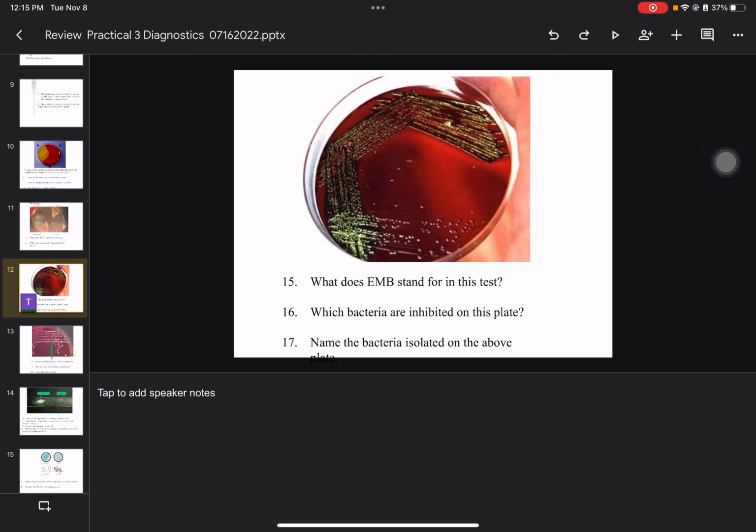All right, here's EMB. What is the pH indicator in EMB? Eosin Y. Very good. Methylene blue and bile salts are added to this medium. Why? They inhibit gram positives. Very good. So what is the principal substrate in EMB? Lactose. What's the application for EMB? Why is it used? Testing water. That's what I need to see. If the organism shows up as a metallic green organism on this plate, what is the organism? E. coli due to contamination.